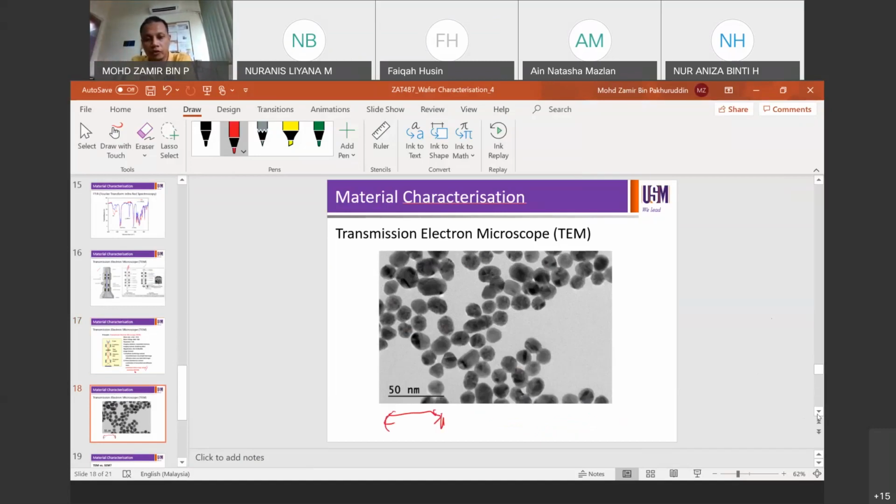Looking at the size of the particles, what's the average size there, do you see? From your eyes, what's the average? If you don't plot a curve or measure every single particle, what do you think is the diameter of the particles there? Anyone? Look at the scale and estimate accordingly. Now think of your skill in viewing particle size with your naked eyes. What size?